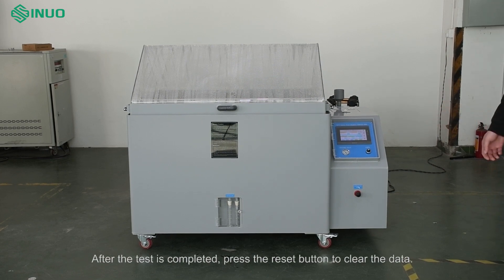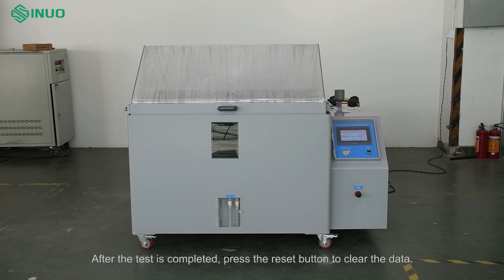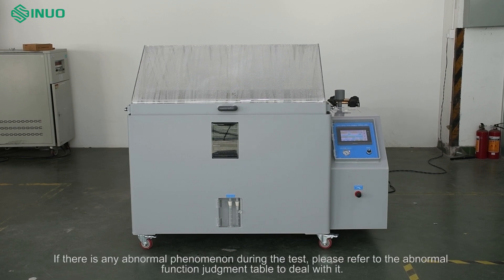After the test is completed, press the reset button to clear the data. If there is any abnormal phenomenon during the test, please refer to the abnormal function judgment table to deal with it.